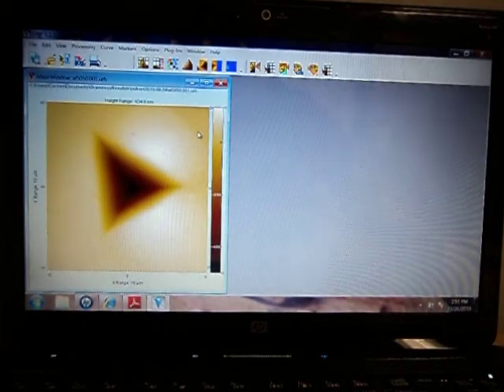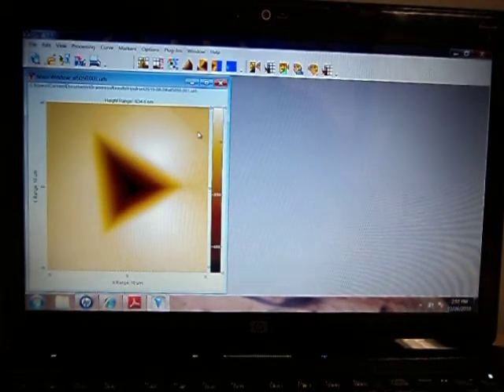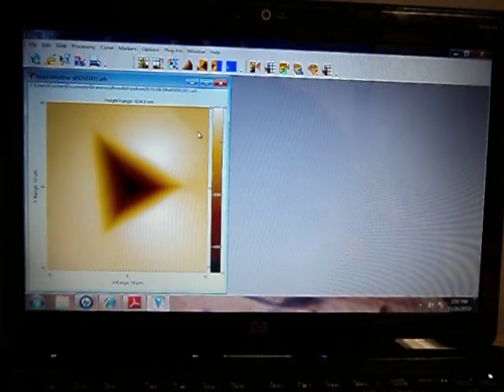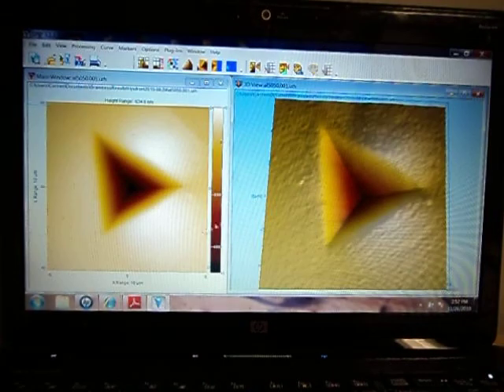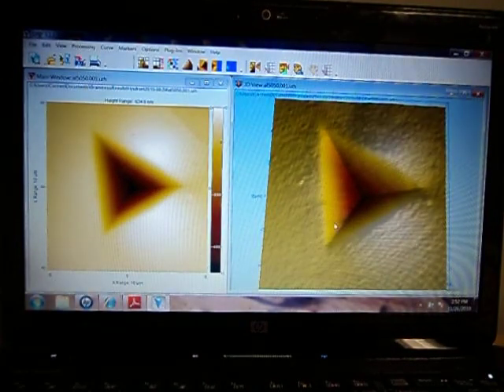Hello. This is a presentation on the hardness analysis function for SPIP. Here's an atomic force microscope image of an indentation made in aluminum.